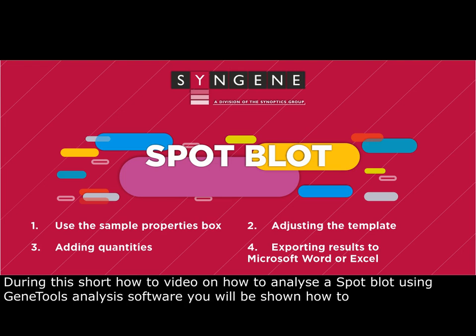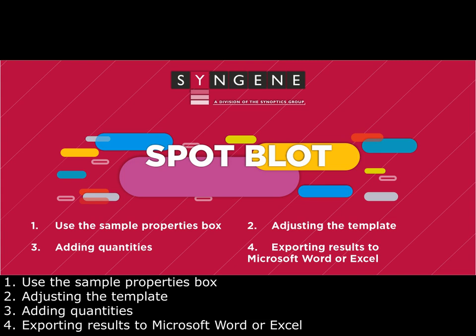During the short how-to video on how to analyse a spot blot using GeneTools analysis software, you'll be shown how to 1. Use the sample properties box, 2. Adjust the template, 3. Add in quantities, 4. Export results to Microsoft Word or Excel.